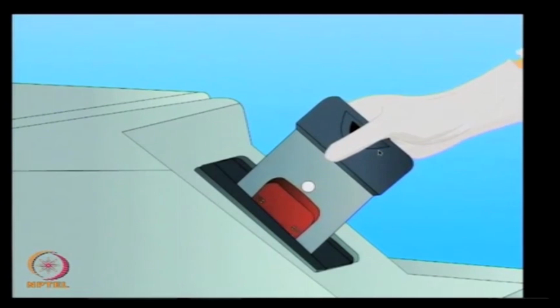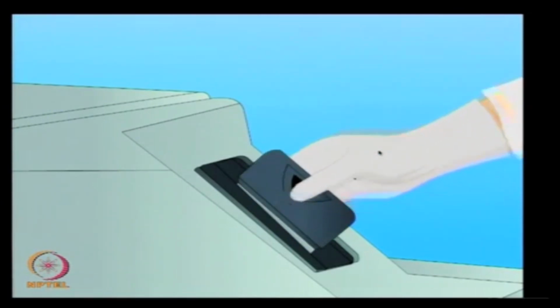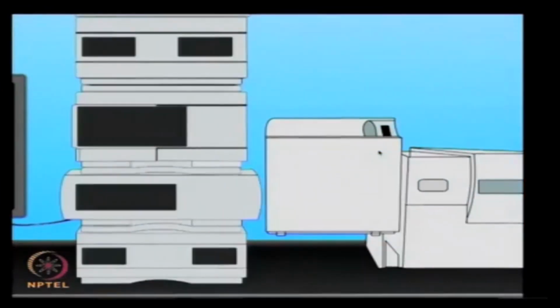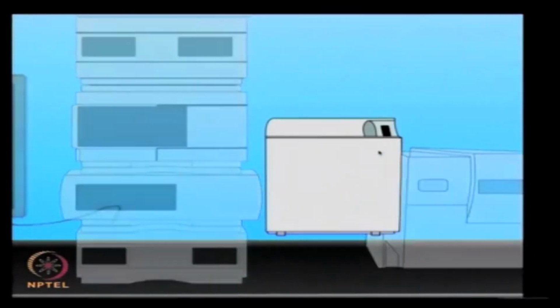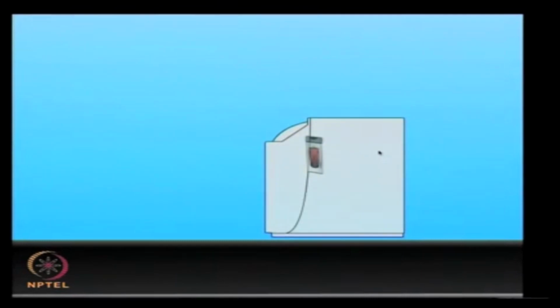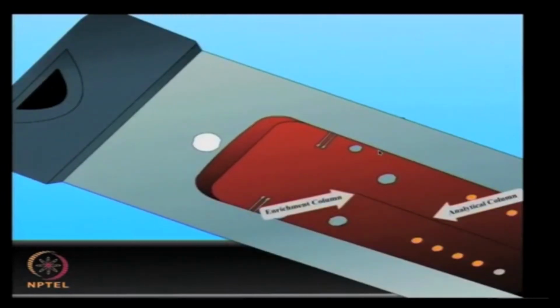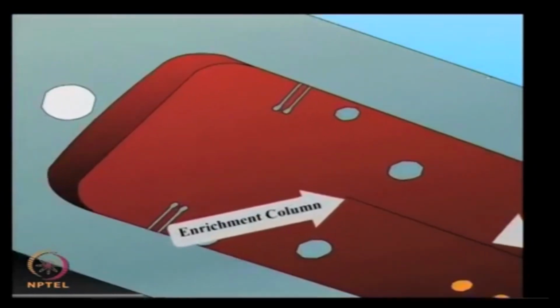The microfluidic device contains circuits of tiny closed channels and wells which are etched onto a glass or plastic microchip. Different forces such as pressure or electrokinetics can push a small volume of fluids in a defined manner.